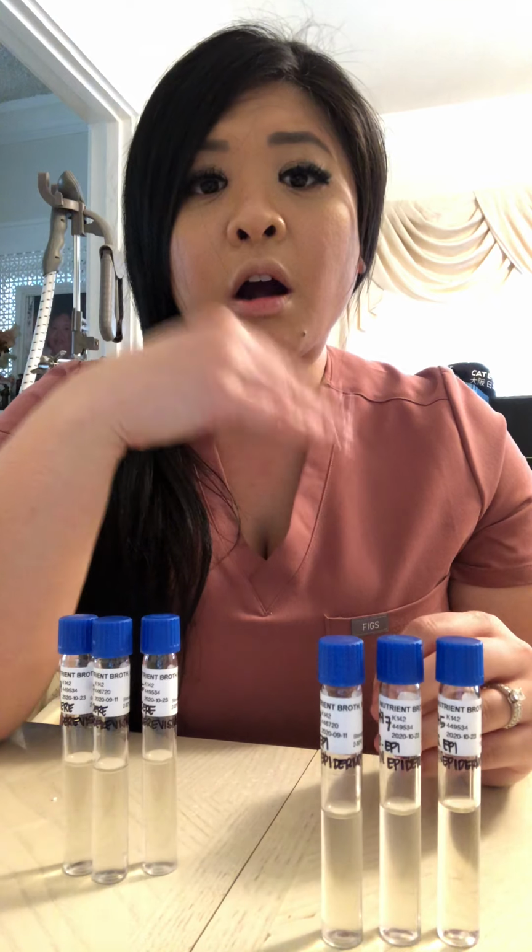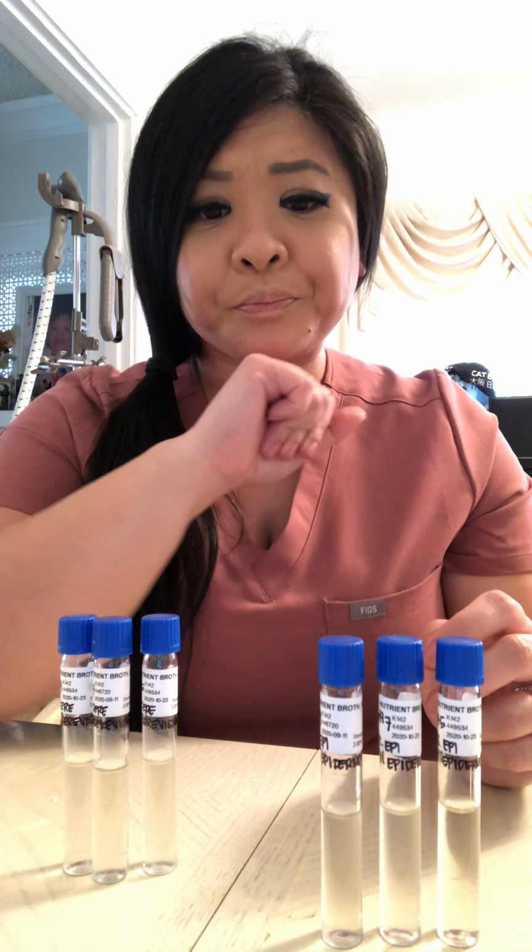The majority of bacteria are neutrophils. And finally, we have the alkaliphiles, which grow from 8.0 to 11.5 on the pH scale. Based on my experiment results, S. epidermidis are in the category of neutrophils and alkaliphiles.